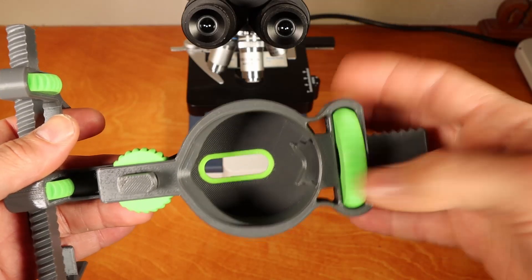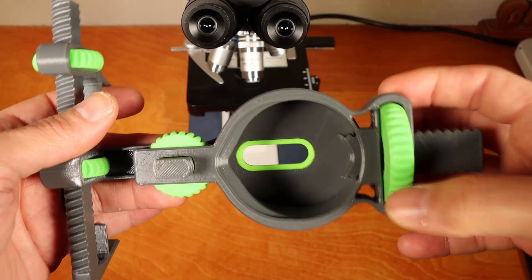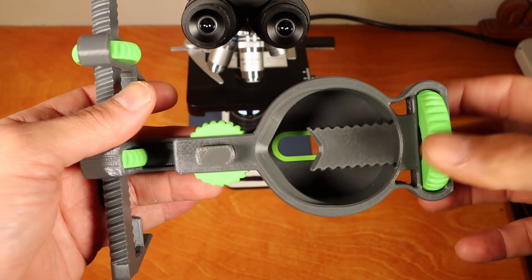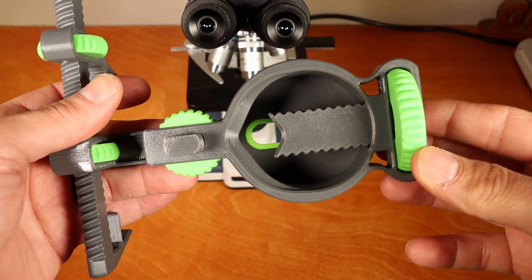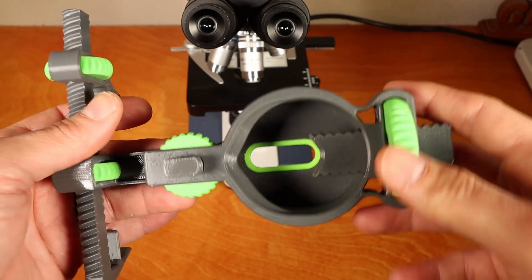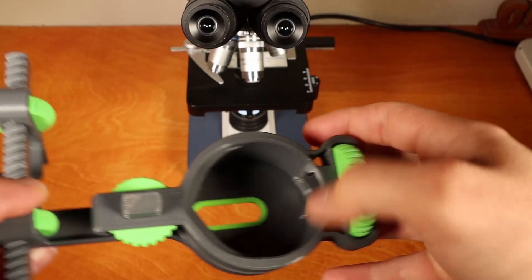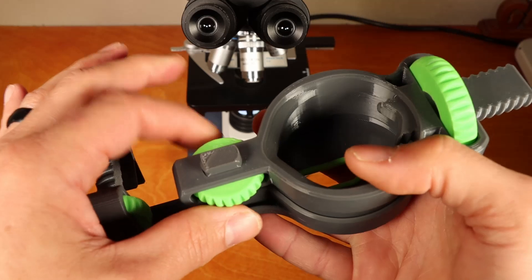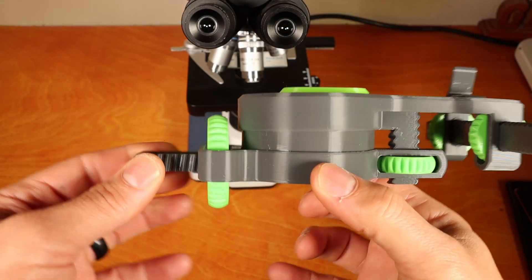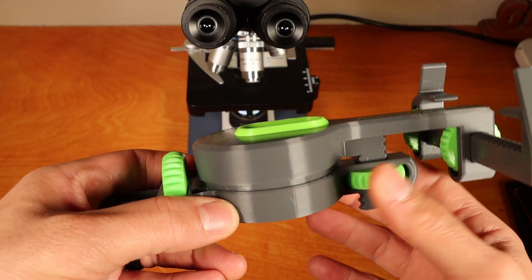If you have an eyepiece that's really big, up to 50 millimeters, you'll be able to clamp it here. And if you have a very small eyepiece, such as one that's 15 millimeters, you can clamp it all the way down to that size as well. Before I begin, I always try to have this open so I can clamp onto it with the area fully open. The Z knob adjusts the distance between where the adapter clamps onto the eyepiece and the camera itself.